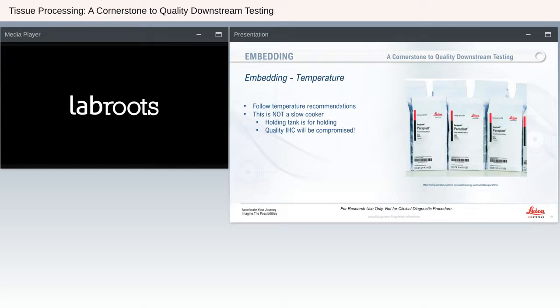This is a critical note, as not only will your IHC be compromised, especially nuclear markers, P53, Ki67, HER2, it's really critical to make sure that they're embedded within a reasonable amount of time and not kept on the embedder. Also, the heat will degrade your RNA.